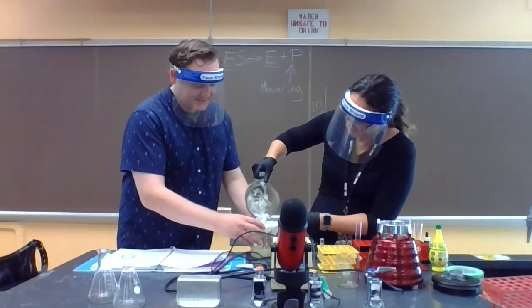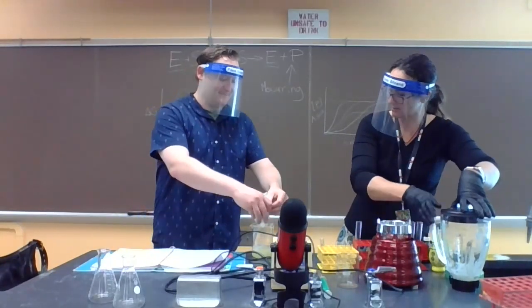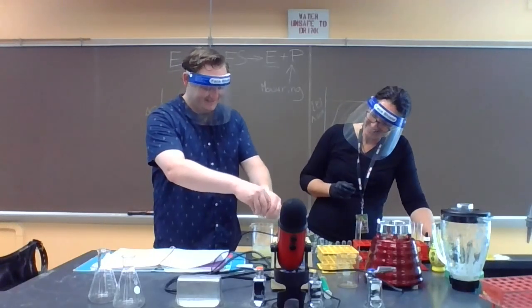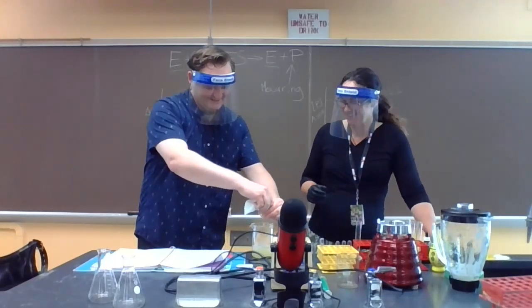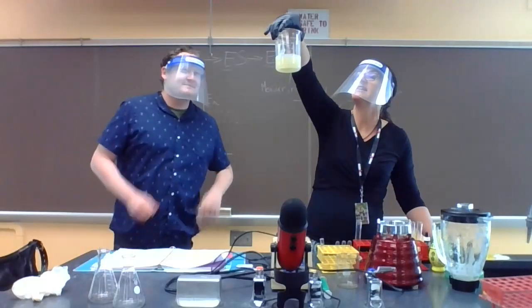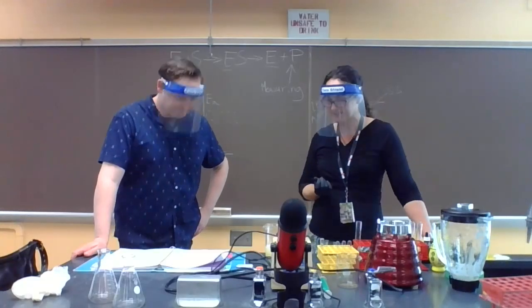Cheesecloth is a nice filter for getting large chunks of things out. It's definitely not like a sanitizing filter or anything like that, but probably couldn't even make a decent face mask out of it, quite frankly. There we go. So perfect. There's our beautiful potato extract, and maybe we'll let it settle for a minute or two just to get some of the starch granules out. Sounds good.